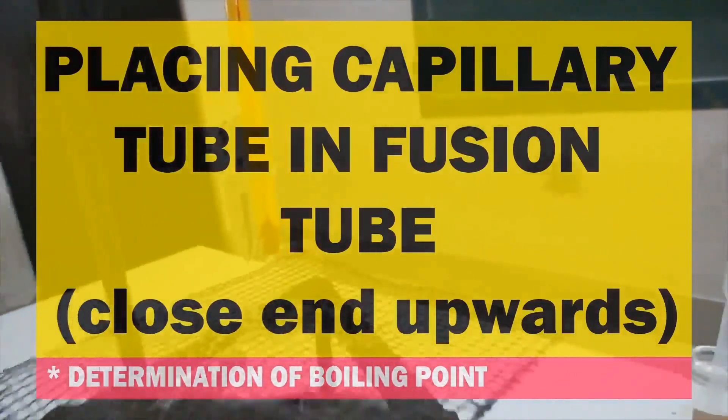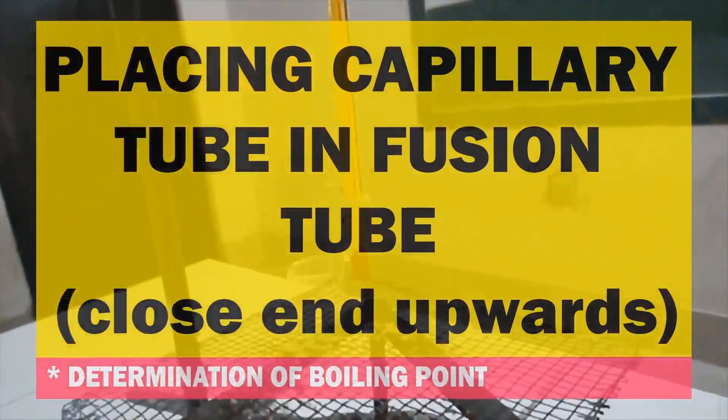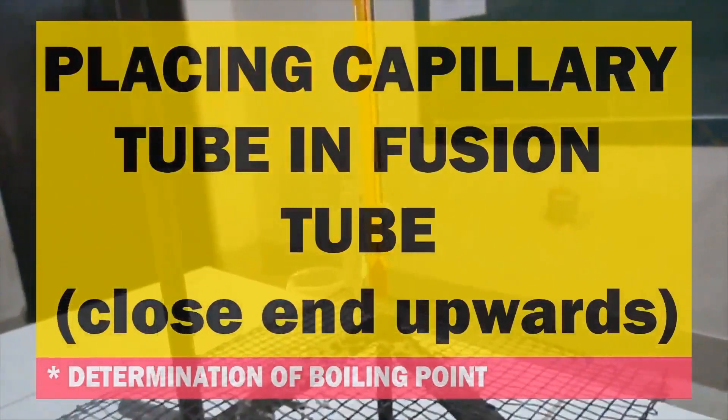Placing capillary tube in fusion tube such that close end is facing upwards.